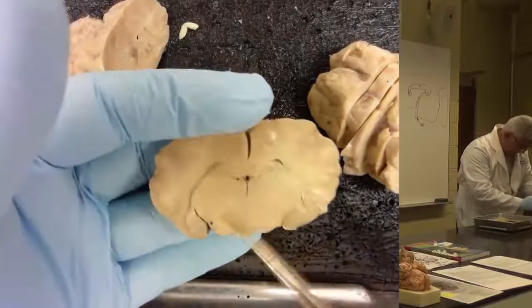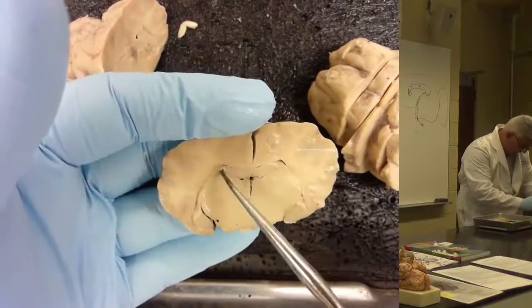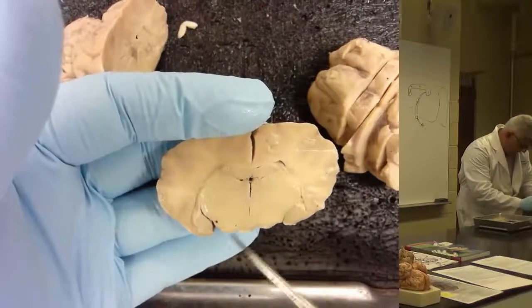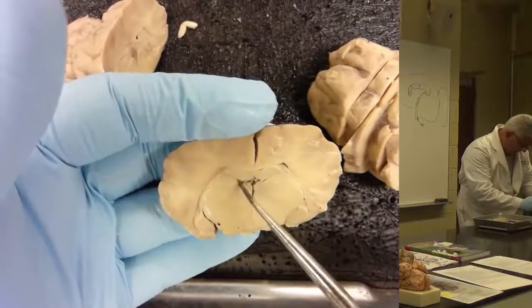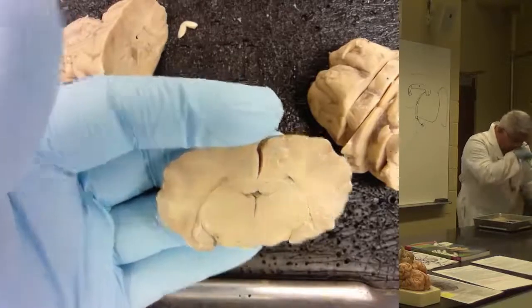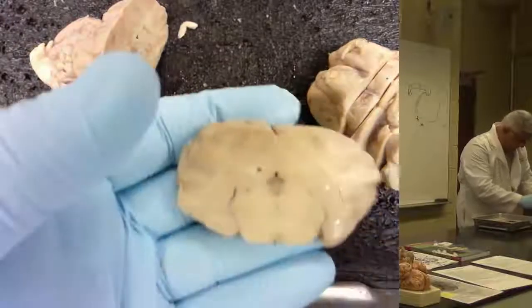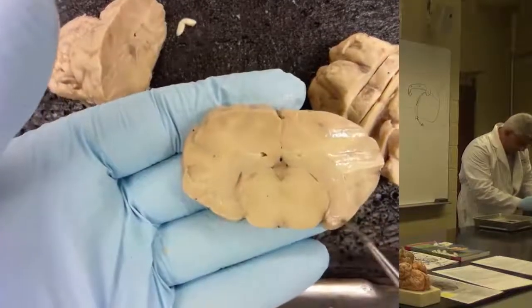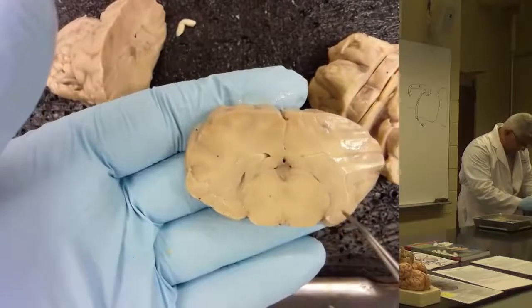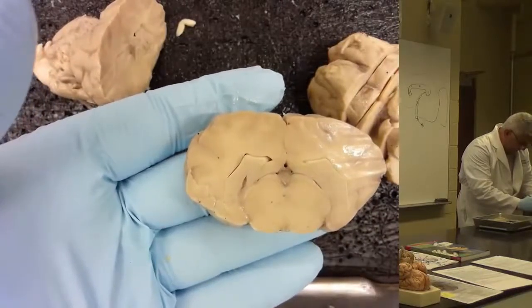Again, here you can just start, so this is hippocampus down here. You just start to see it coming around to make the hippocampus. We still have third ventricle here. If we flip around to the back side of this, now you really see how that hippocampal gyre is coming around there. We now have our pineal gland, and we have our hole for the cerebral aqueduct.